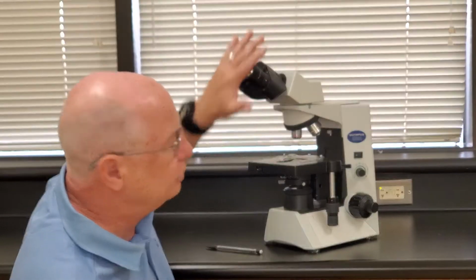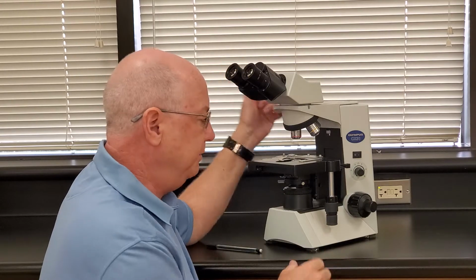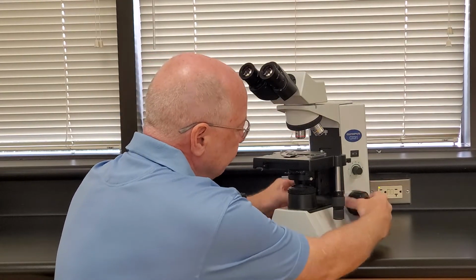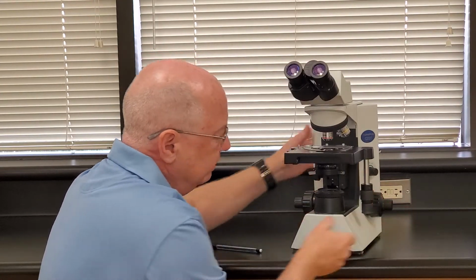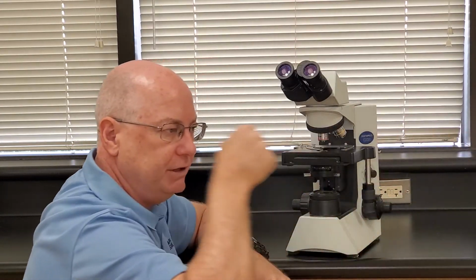So the first thing you do when you mount a slide is you don't even look through the microscope. You look from the side here and you make sure that your slide is centered. What does that mean? Well, I'm going to raise this stage up for a second and show you a couple of things underneath here. This black tube sticking up from the base is called the lamp or the light source. In order to see things, we have to shine photons of light on it. The photons bounce off the object, hit your eyeball, and trigger a visual response.